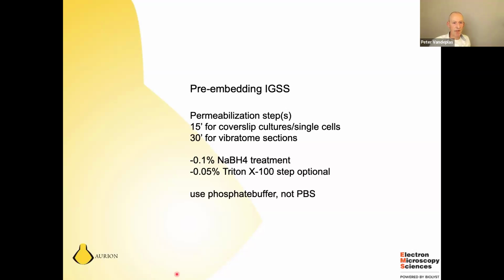And if you have a positive result, the positive control, then afterwards embed these specimens or specimens that are simultaneously incubated this way, embed them in epoxy resin, section for EM, go towards the EM, and when you are behind your EM microscope, then you are certain that there are particles there because you have already checked them in the LM beforehand.